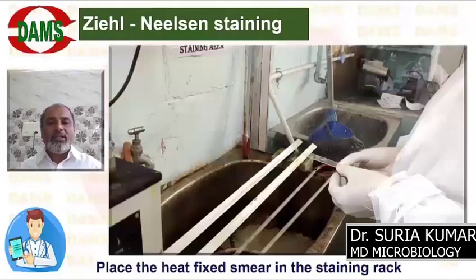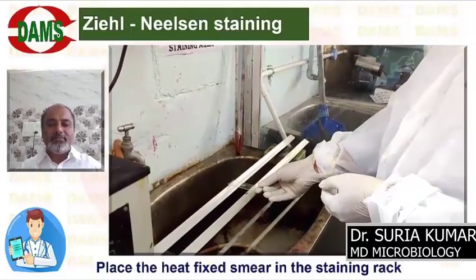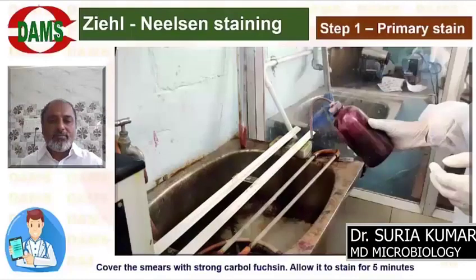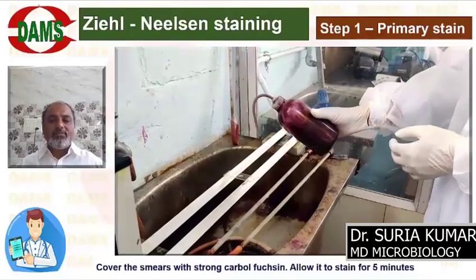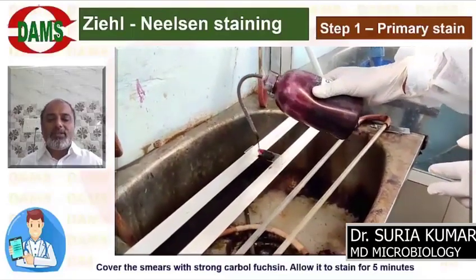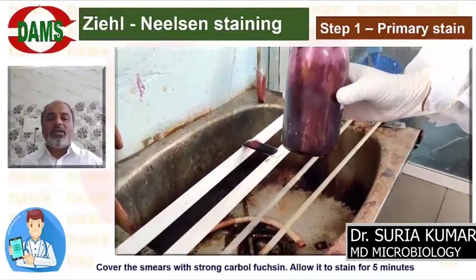So we need a heat fixed smear in the staining rack. After keeping the heat fixed smear, we are going for the staining procedure called primary staining. In the primary staining, we are going to cover the smear with strong carbol fuchsin and allow it to stain for 5 minutes.